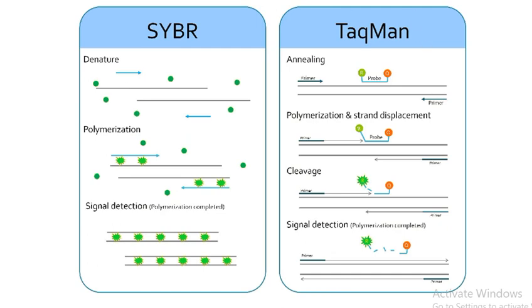In the TaqMan, there is one special case: you should know your DNA well in advance, and when you use that DNA, you are taking another sequence of DNA which has a fluorochrome and quencher. So this probe has specific sequences, and you know this limitation, you should know your DNA sequences well in advance. So this probe will directly bind to your DNA complementary strand.